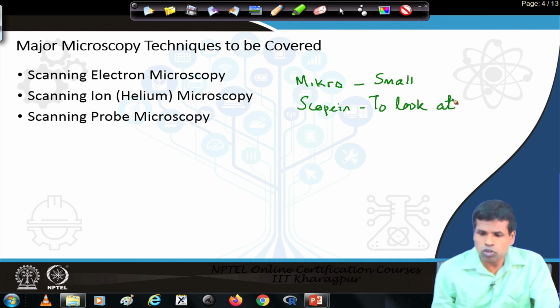So, an instrument or system that is used to view objects that are too small that we cannot see by naked eye is called microscope. And the science of investigating such small objects using the microscope is called microscopy.